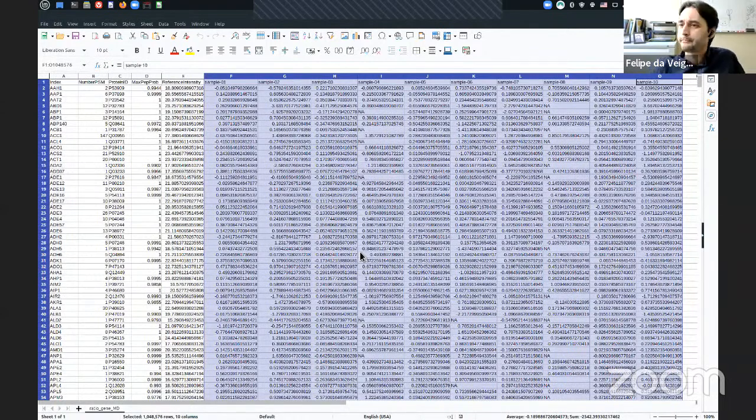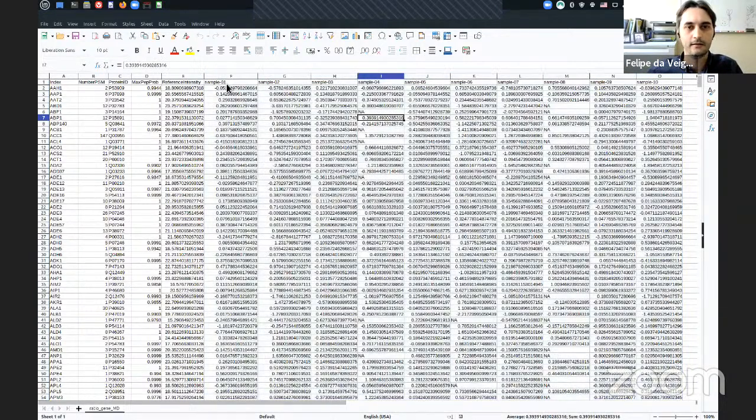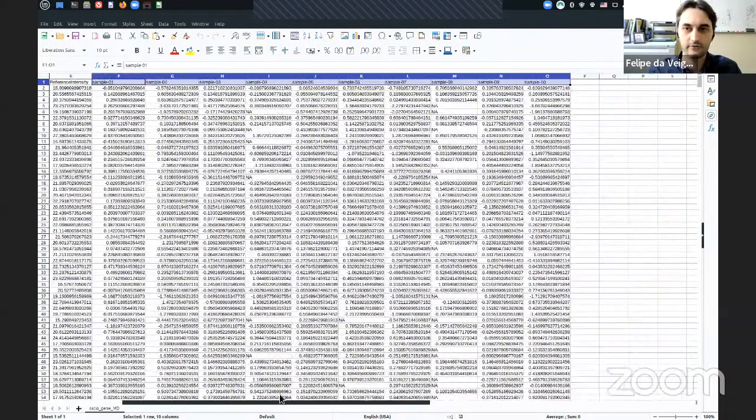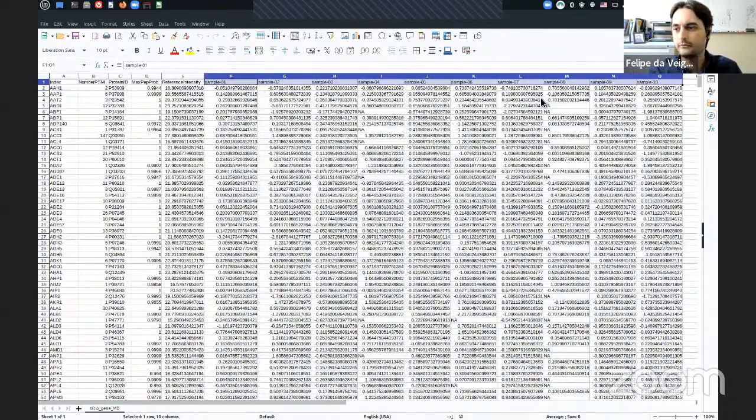Now, let's say that you have two TMT 10-plexes in this analysis, you'd have 20 columns with the abundances on this table. If you are analyzing 10 TMT plexes, you're going to have 100 columns. So all the quantification from all the observations from all experiments is summarized in this single table, and their labels are going to be as you pointed out in the annotation file. So this is a pretty simple table. It's just the indexes and the quantification.